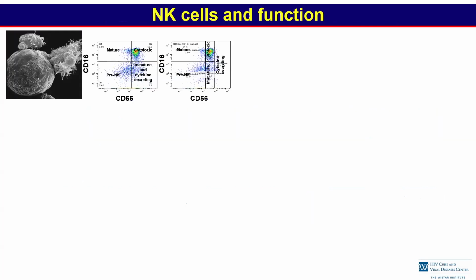As you saw in the title, we're going to see if trophoblast cells exhibit any phenotypic or functional characteristics of NK cells. So I put a small introduction here. So what are the NK cells? NK cells are the main cells of the innate immune response, and they are defined by flow cytometry. We define them by the lack of expression of CD3, CD14, CD19, and CD20, and the expression of CD16 and CD56. So here you see a dot plot of flow cytometry where we have CD56 versus CD16.